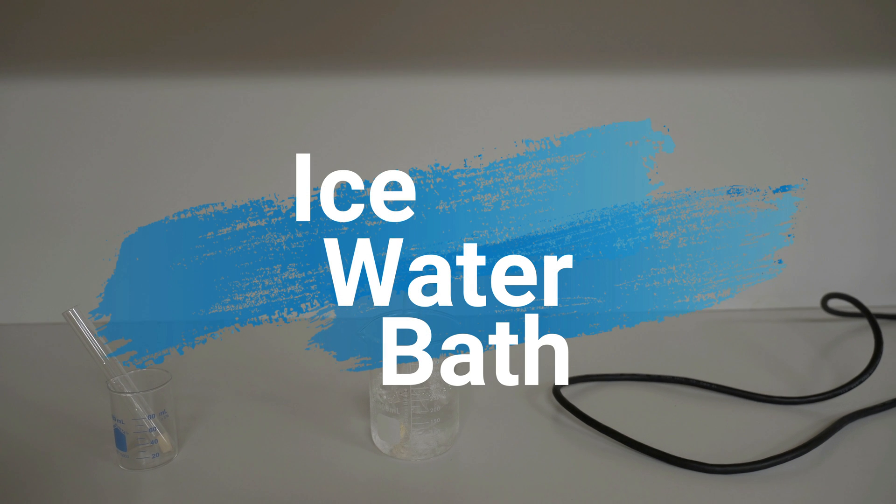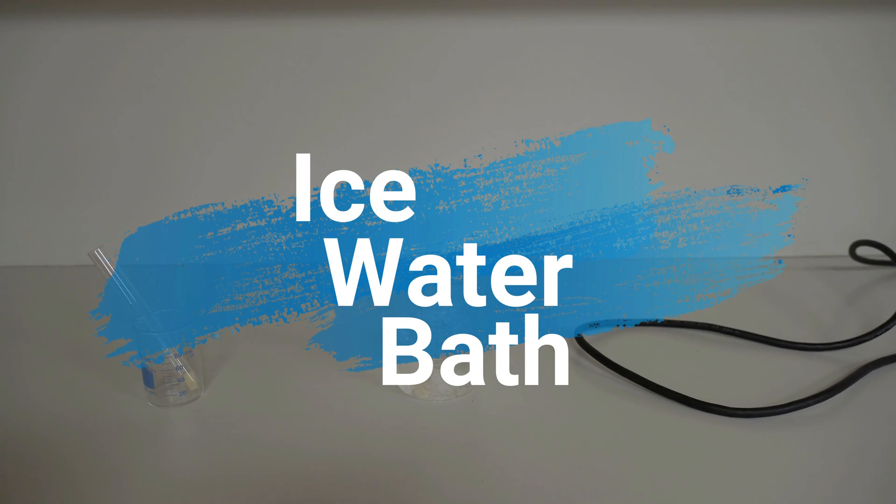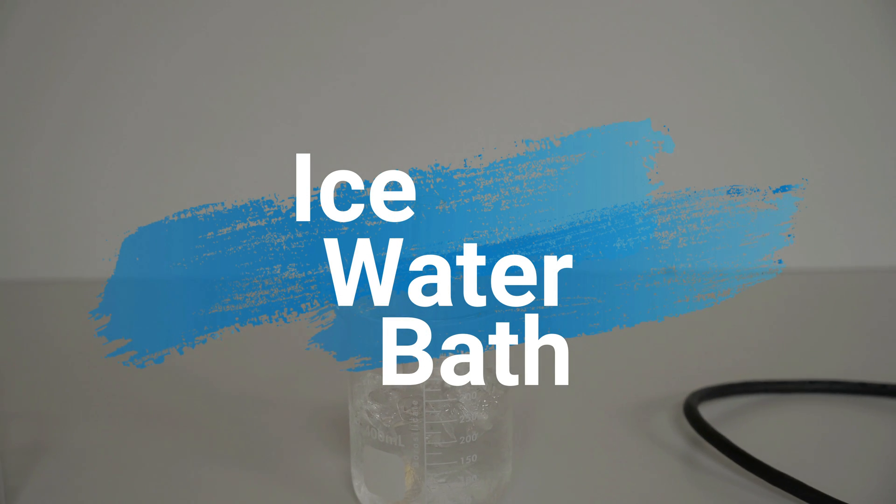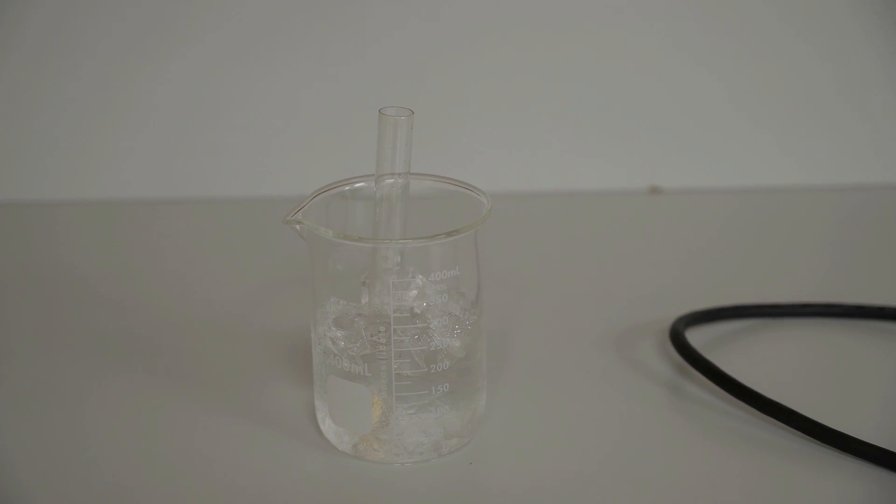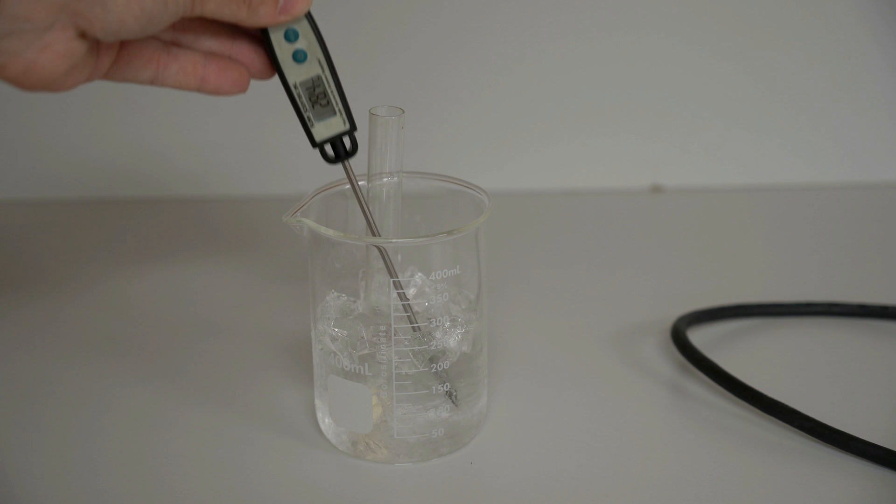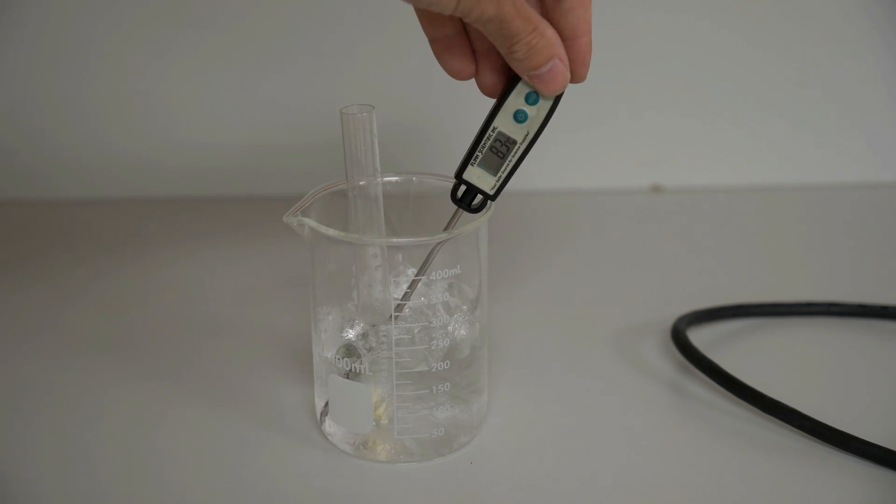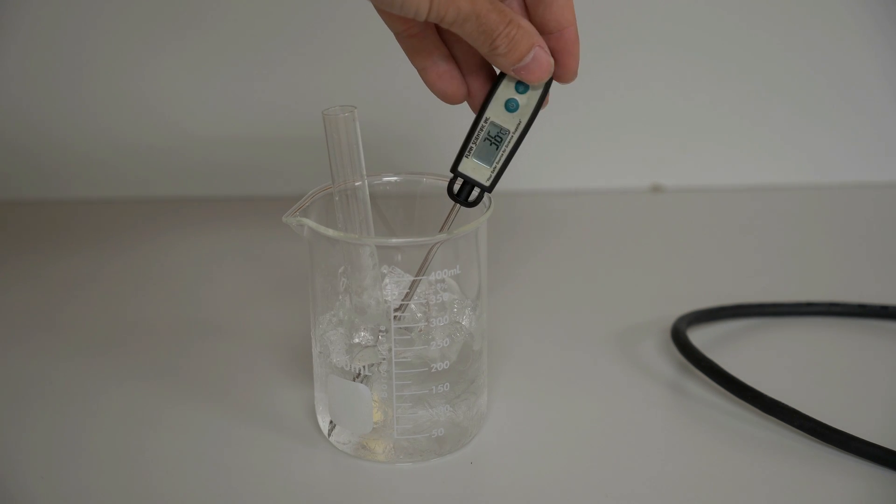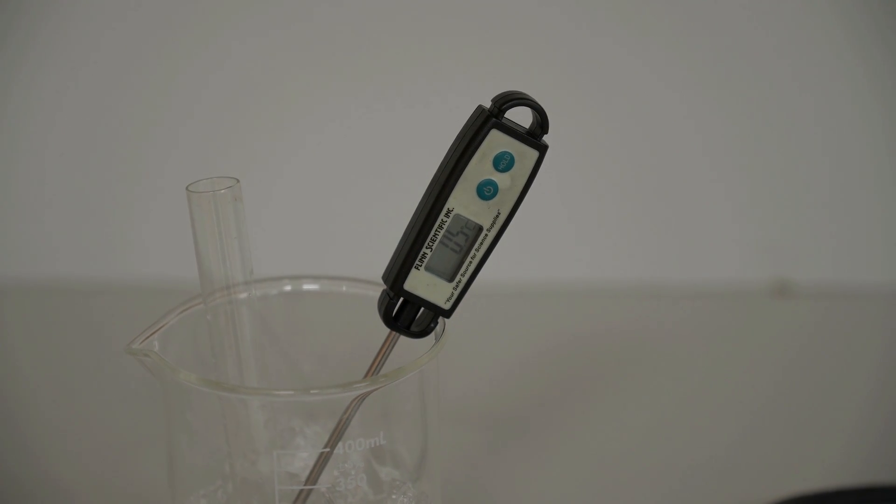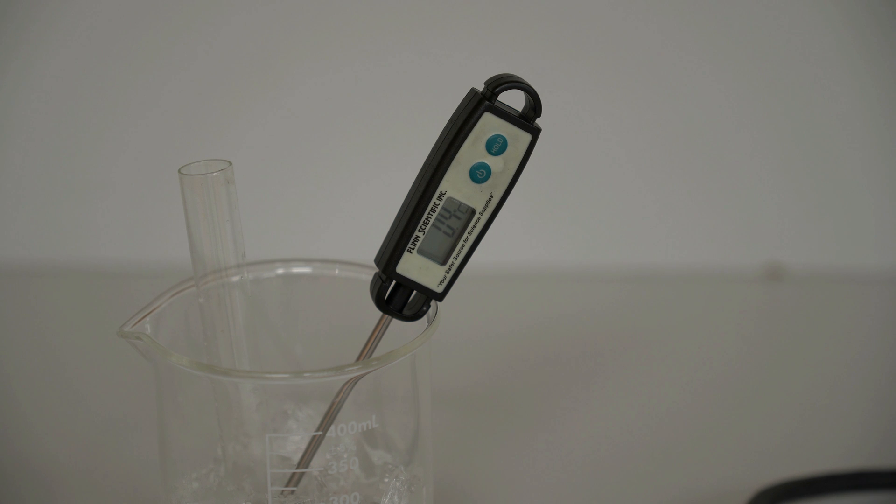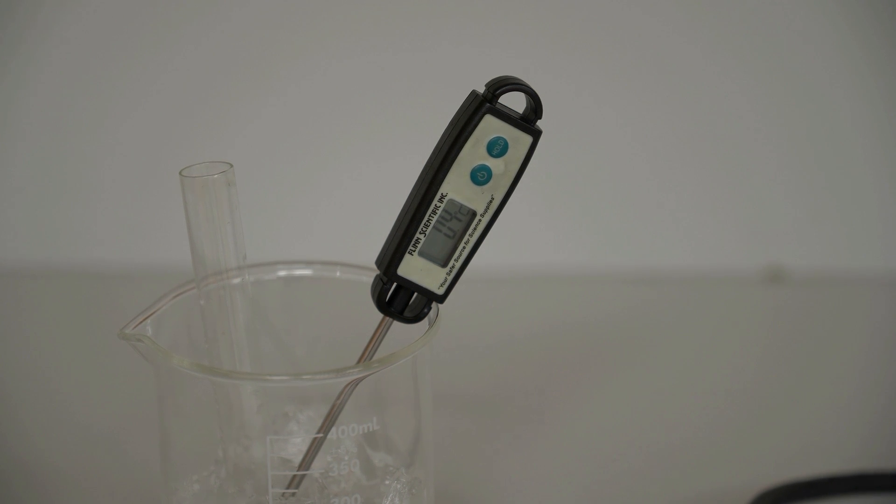Moving on from warm water, we're going to go to the ice water bath. Here I have some ice water that is melting. Let's determine what the temperature is of that ice water. We've got our little potato literally chilling in there. As would be expected, it's much cooler. We're looking at about 0.4 degrees Celsius.